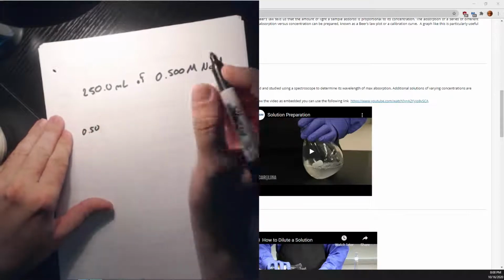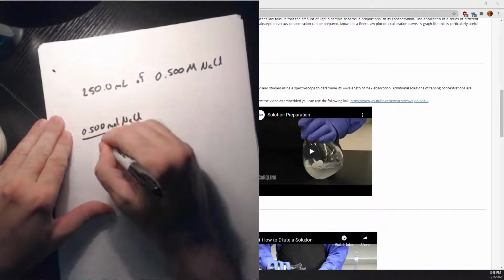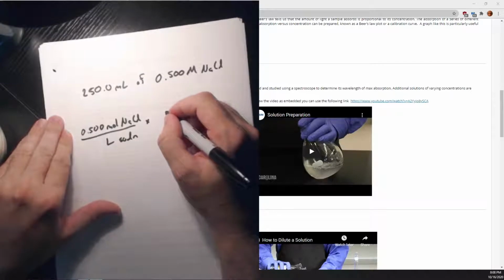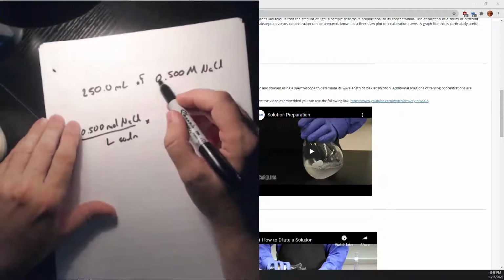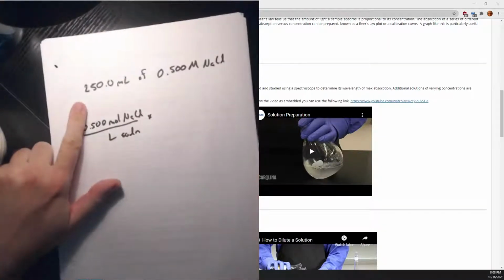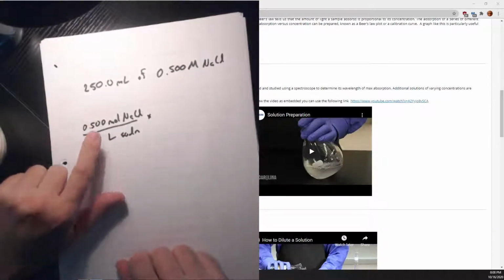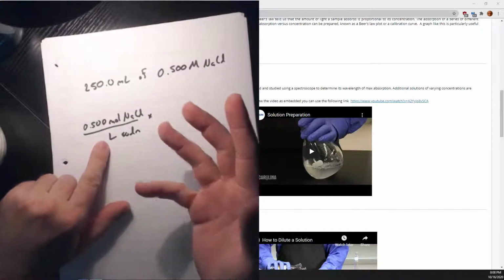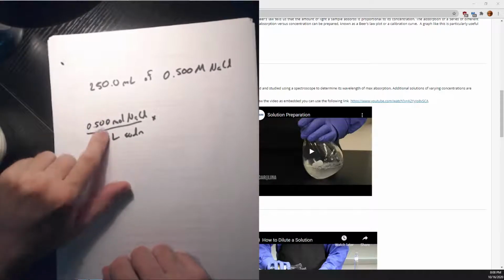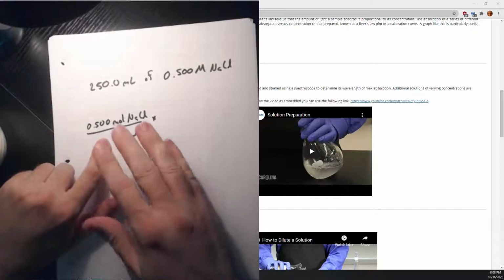So we look at our thing, okay, how much sodium chloride do we need for this? Well, that's still 0.500 moles of NaCl per liter of solution. We want, liter and milliliter. That's a disconnect. Well, this is just one of those unfortunate things. We typically work in mils because those are a convenient size for small manipulations. But molarity works in liters because that's convenient for large manipulations. And we have to be able to go back and forth between these two because we usually make a lot of solution when we're talking about routine work.